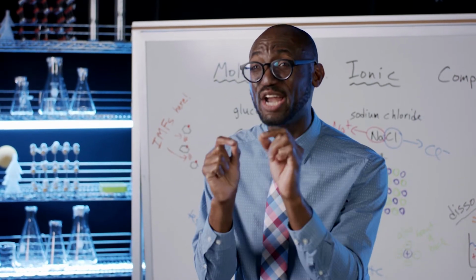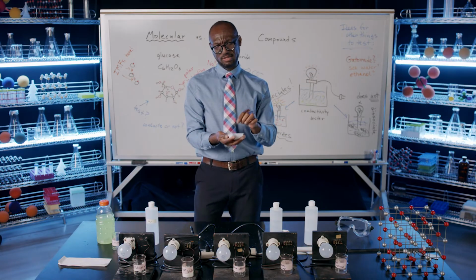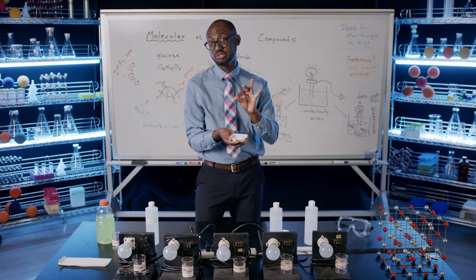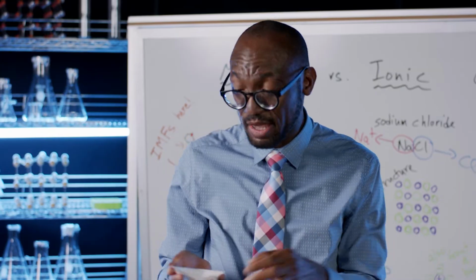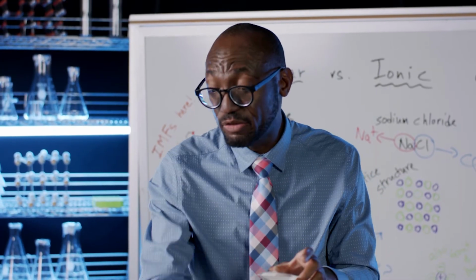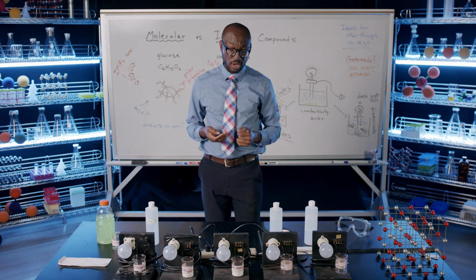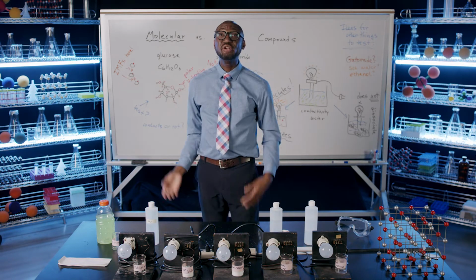Let's try something ionic. Maybe we'll get a different result. So everybody knows table salt. I have some, sodium chloride, here. I use way too much in my cooking. It is made up of sodium cations and chloride anions, and I'm gonna put some into this beaker. So I've put the electrodes in the beaker of sodium chloride, turn the lights on, and once again, nothing happens.